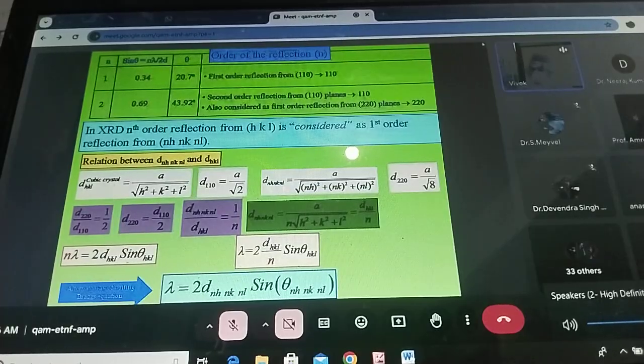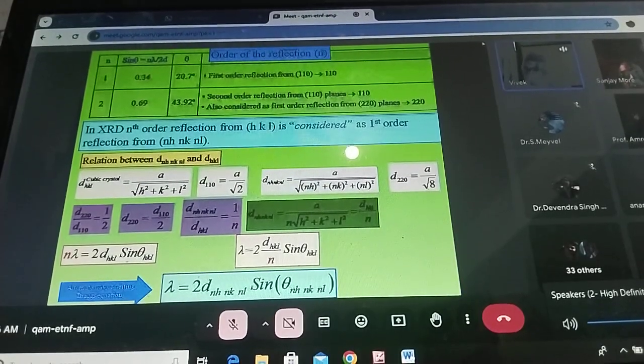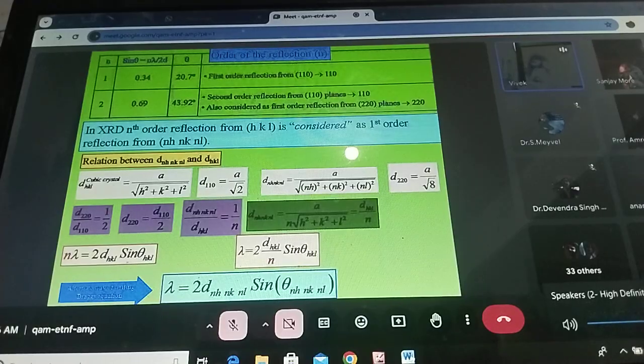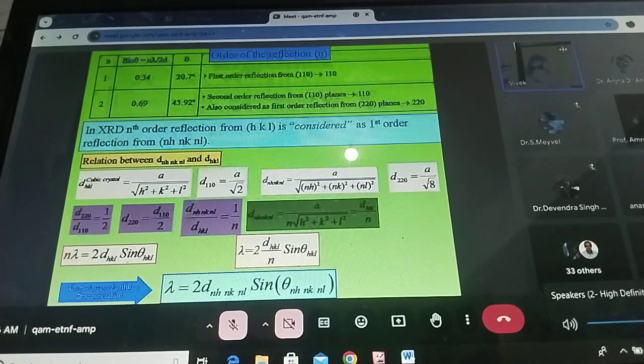So recently I got one structure, in that case 85% of the structure came the same, but 50% of the molecule is coming with an NO2 group also. So two molecules are coming. The chemistry person says it can never happen, but he has put a solvent having cyanide in it, so that the CN group has made some kind of reaction with the molecule and nitrogen is coming. So the crystal structure cannot tell a lie. That is the point.